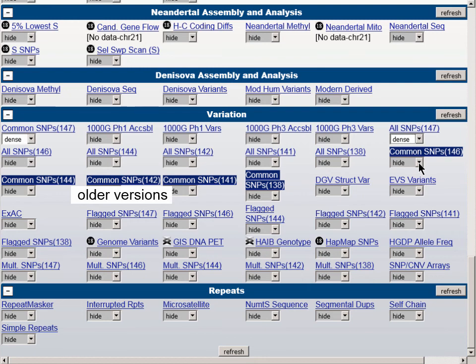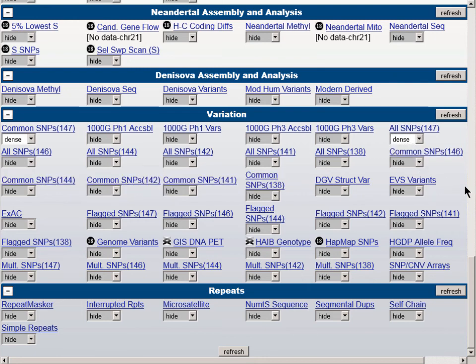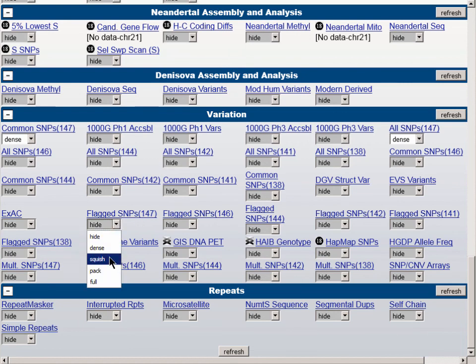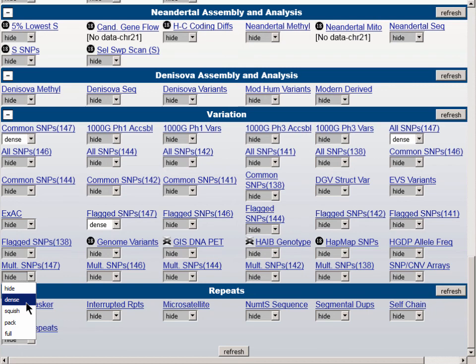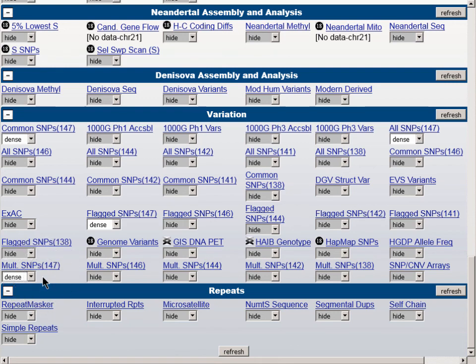There are two other kinds of SNP tracks representing different subsets of the All-SNPs tracks: the Flagged SNPs track and the Multiply Mapping SNPs. We'll set these to Dense as well. Briefly, the Flagged SNPs are those flagged by DBSNP as having been contributed by a locus-specific database for which a phenotype might be associated. In DBSNP, the clinical bit is set to 1 for these SNPs. A SNP in the Flagged SNPs track is not necessarily a risk allele itself, but it is in a gene for which there are risk alleles. The Multiply Mapping SNPs are those that map, using the flanking sequences around the central variant, to more than one place in the genome — good to know for genome-wide association studies.